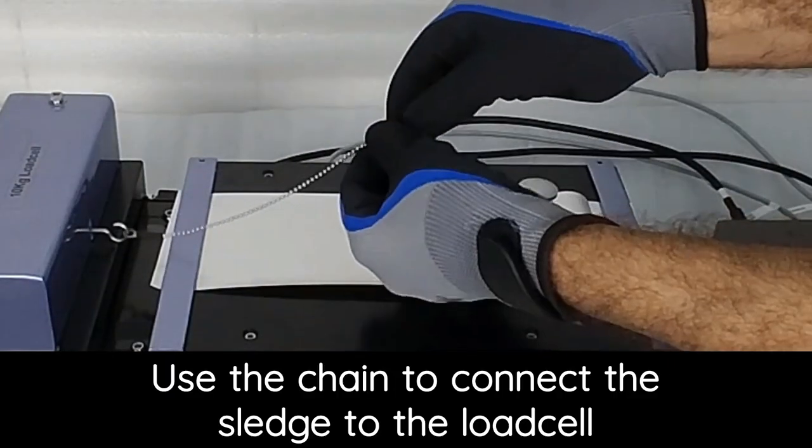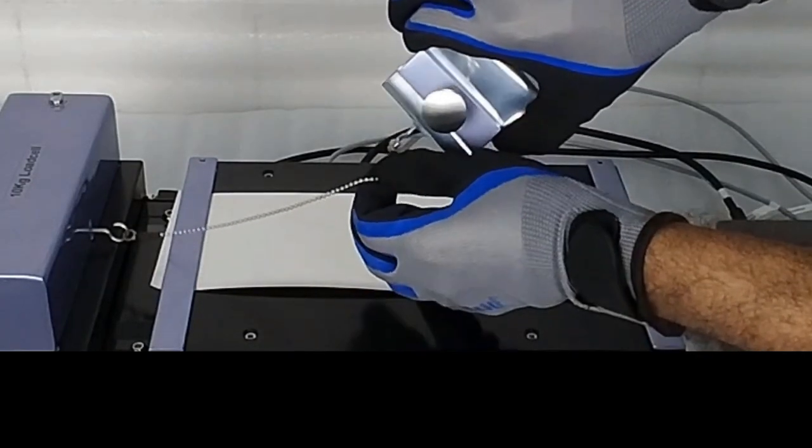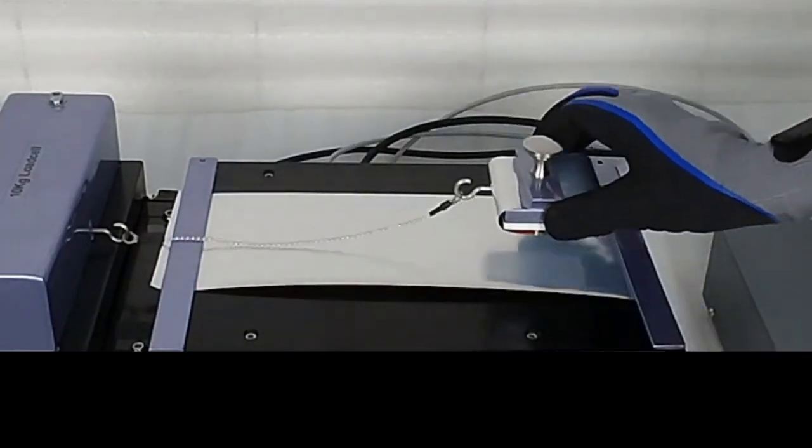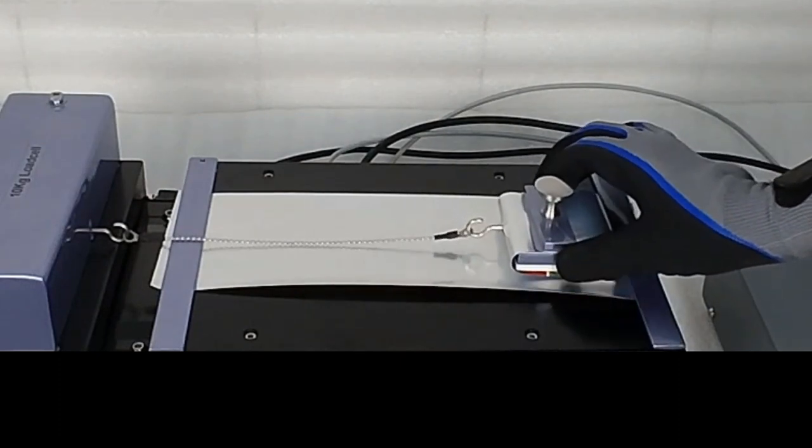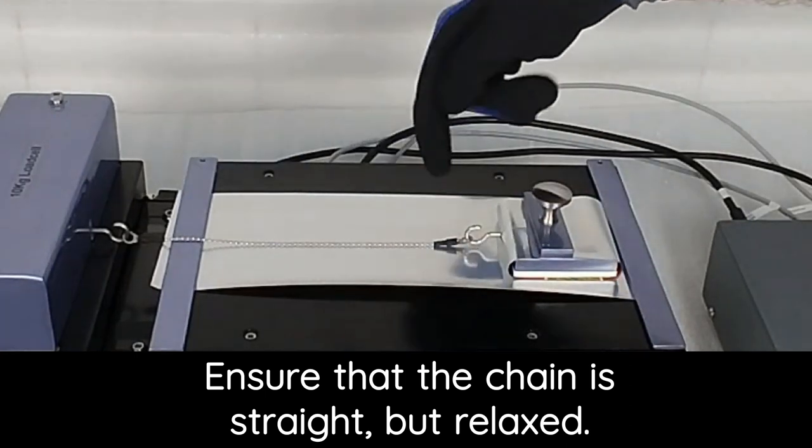Use the chain to connect the sledge to the load cell. Ensure that the chain is straight, but relaxed.